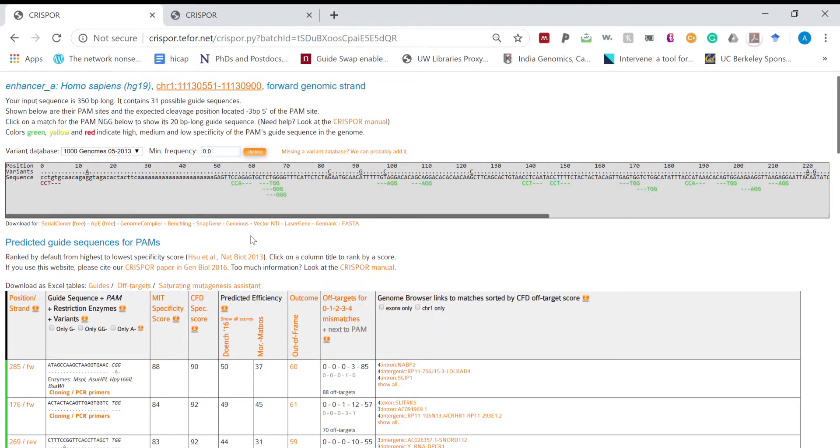Also to further observe this site in the bench link tool, let's download the bench link file result.